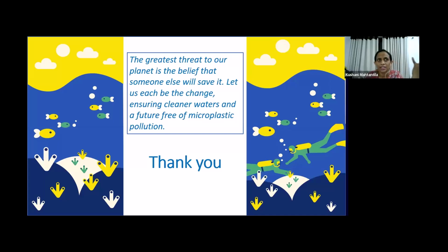We use wide-mouth glass bottles, not a glass funnel. If you want to evaluate the environmental deposition, use a wide-mouth glass bottle to collect, taking care during sample transfer. However, if I want to analyze human exposure to microplastic dust, then special devices that measure human respiratory intake are available.